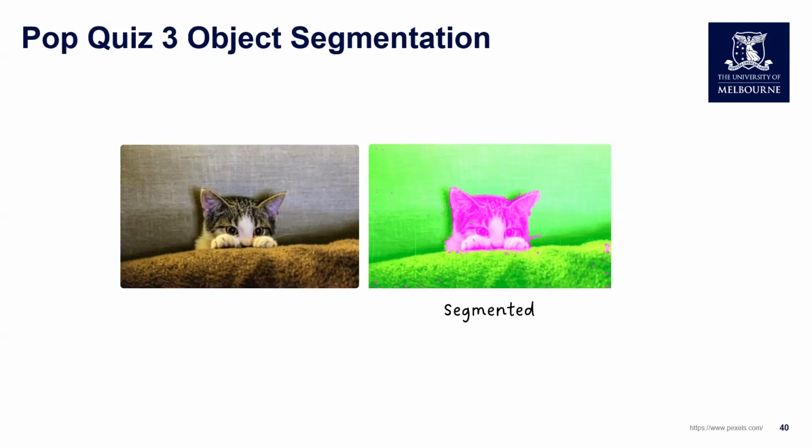And share the results. Right, so the first question was, in conventional segmentation, what is the best way to set a threshold on a dataset with various background levels? And yes, the majority of people have selected the right answer. Rather than applying a single threshold value, which may not be applicable for different images with different background levels, we can calculate the background level for each image using the same type of algorithm. So the second answer, applying the same auto threshold algorithm, is the right answer.